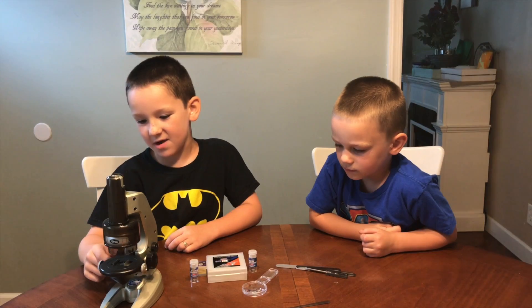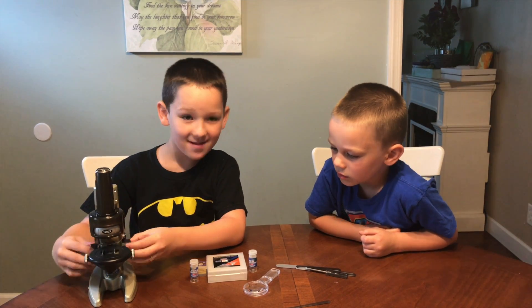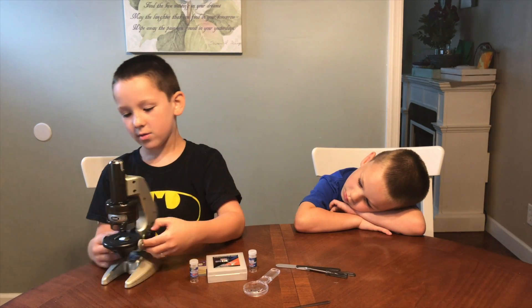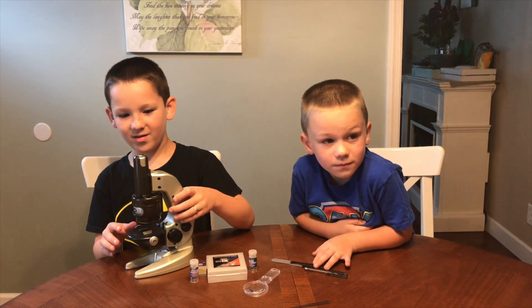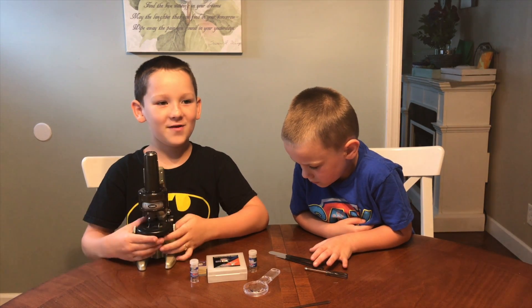We got it open. Let's check out what it comes with. First we have the microscope itself — it does this to raise it up and down. Turn it on when you're looking. The light will turn on, but it needs two AA batteries which are not included. And if you look at the front of it, you can change the magnification level three times.